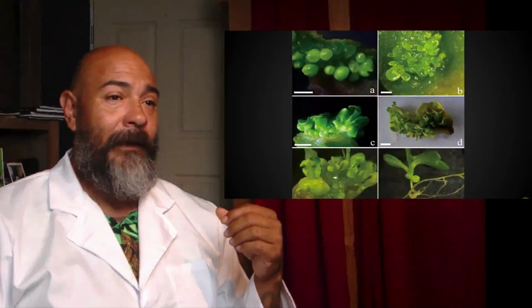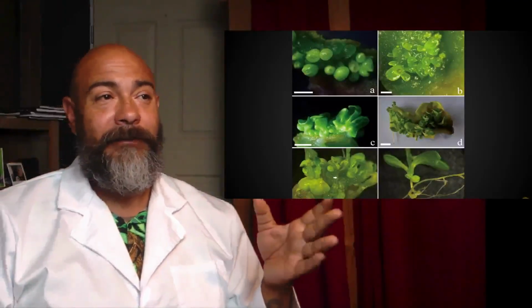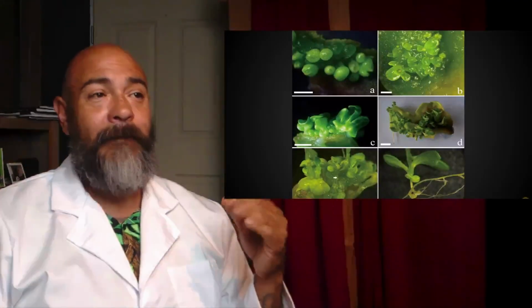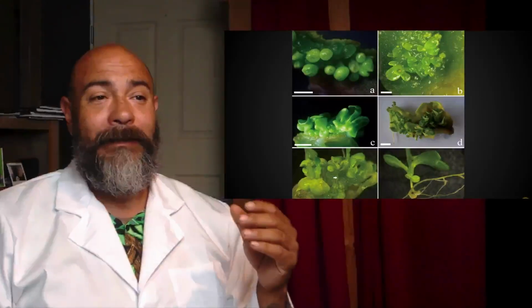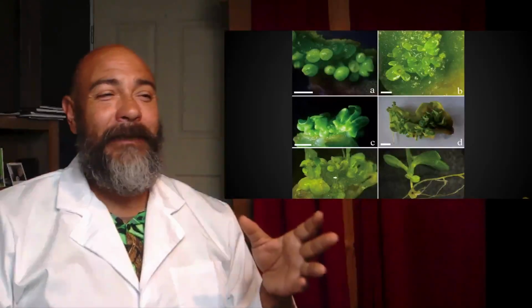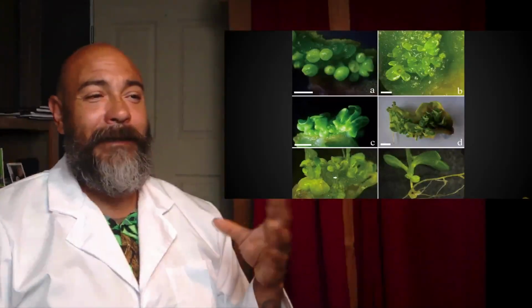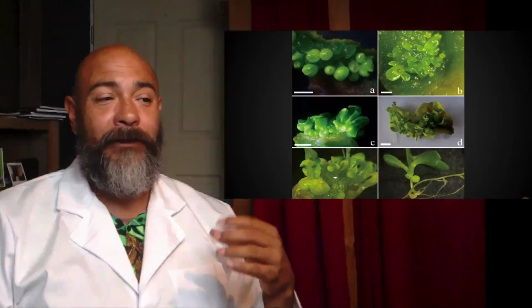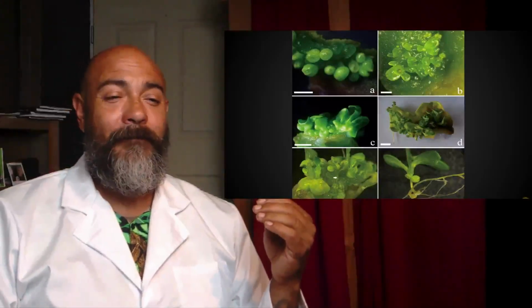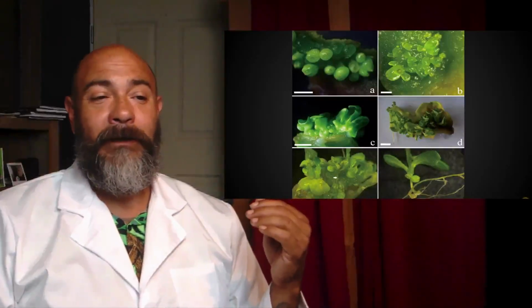Here's another representation to kind of show you. Image A starts off with your globular material. It begins to swell in image B. By C, you've got little plantlets or the heart-shaped growth coming out, and by D, you've got your cotyledons, and by E and F, you're already dealing with small little plantlets.